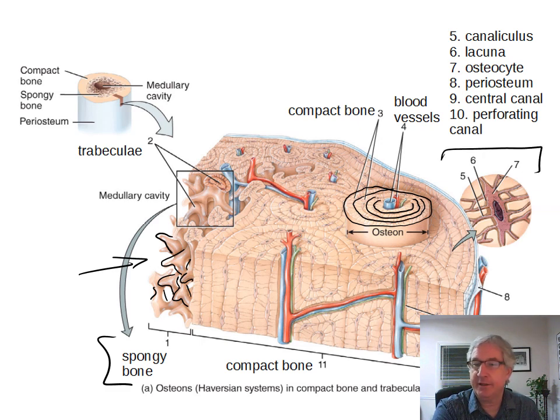So you have an osteocyte, this black part in the middle, and then you have, well, that's the nucleus. And then the osteocyte is in this little region that it made, this little house it made for itself, and then all these parts sticking out to the side are canaliculi, where the osteocytes can communicate with the blood vessels that are in the central canal of the osteon.